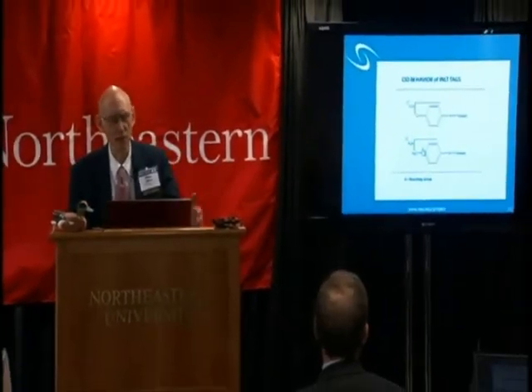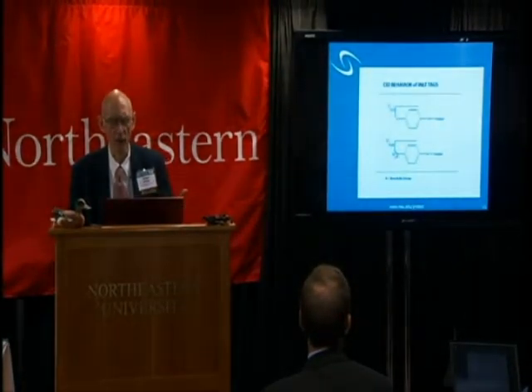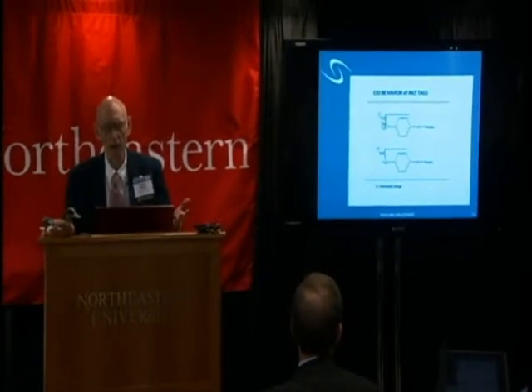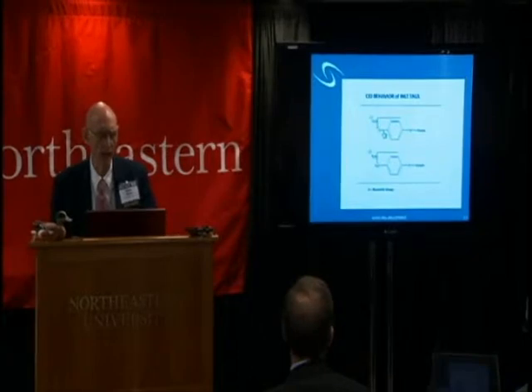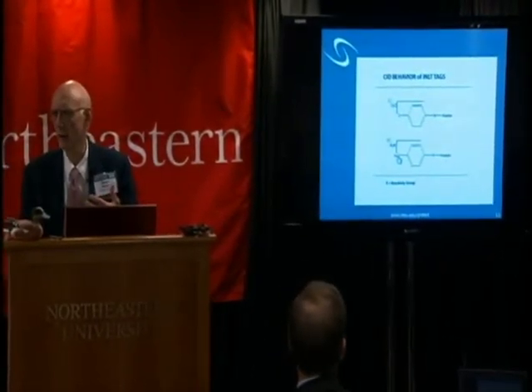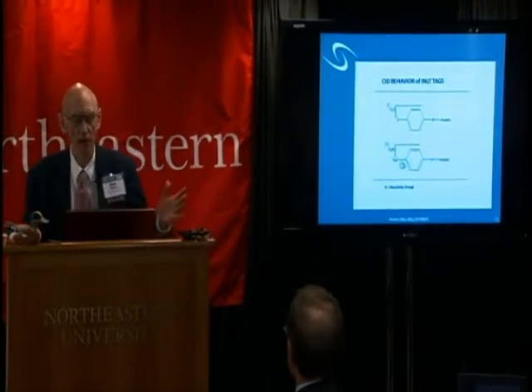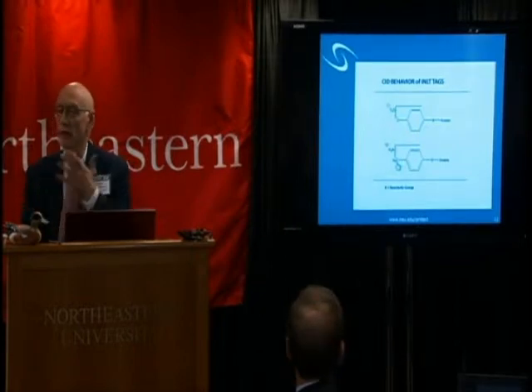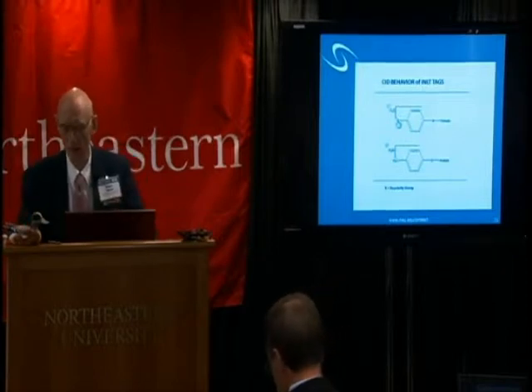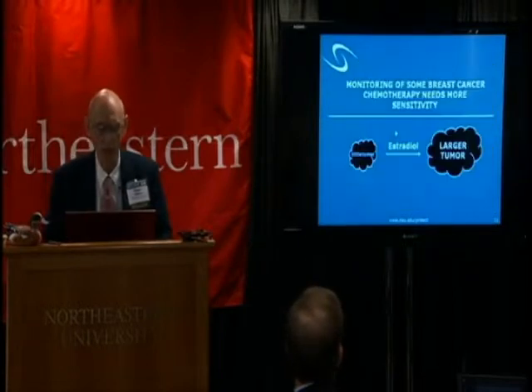So here's the actual chemistry. We take advantage of a sulfate or a quaternary amine where the sulfate can readily lose an SO3 neutral and then becomes a phenolate anion, or it's a benzylic quaternary amine, and then we get a benzylic cation. So you see what we have here is resonance stabilization of the ion, and that ion stays with the analyte, so we get an analyte characteristic signal. And so this is the basic idea of these tags, and then they're charged up front, so they really do well in the ion source.